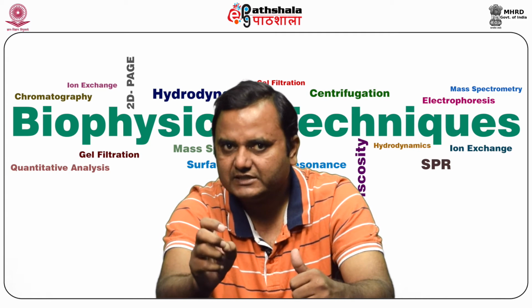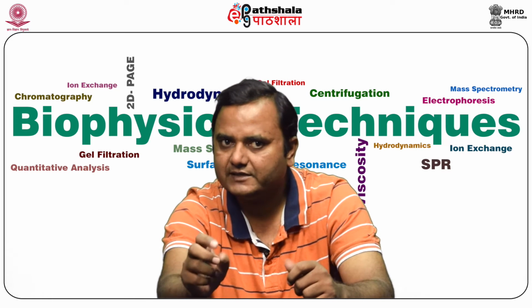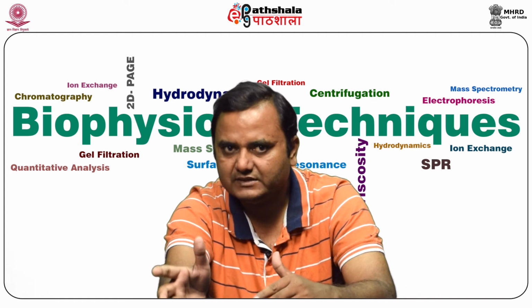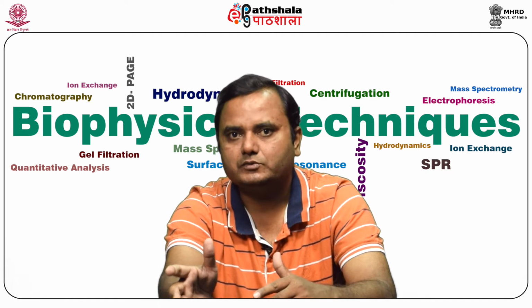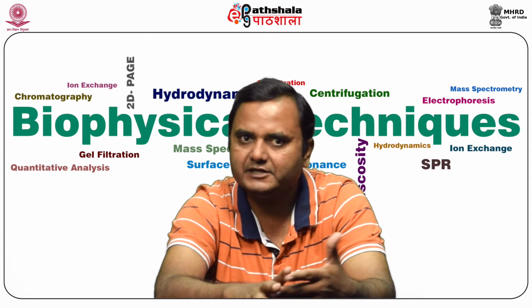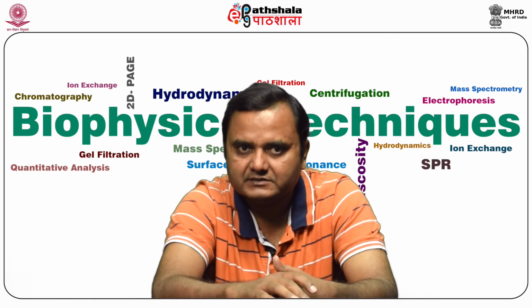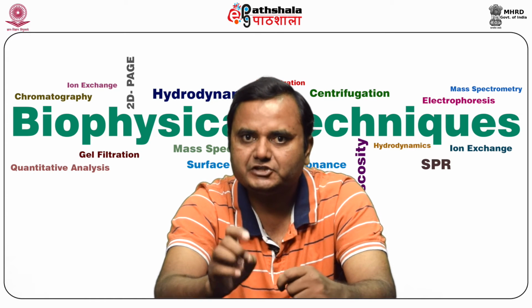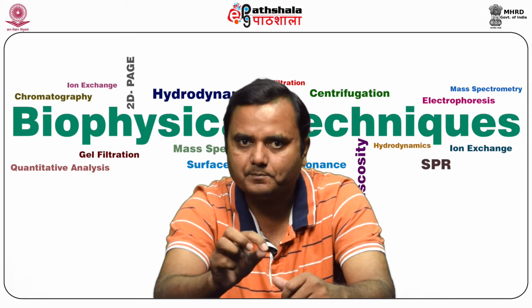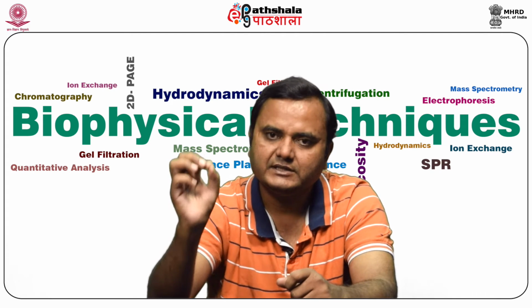So this equation clearly indicates that the sedimentation rate of the particle is proportional to the size. The bigger the size, the bigger the sedimentation rate, and the smaller the size, the lower the sedimentation rate. So it directly depends upon the size of the particle. Then the sedimentation rate is proportional to the difference in density between the particle to be separated and the density of the medium.